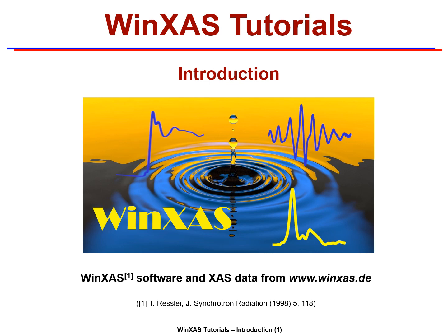This is the first video in a series of tutorials where I want to talk about using the WinXAS software to analyze experimental data from X-ray absorption spectroscopy measurements. Except for this first video, tutorials will consist of two parts.